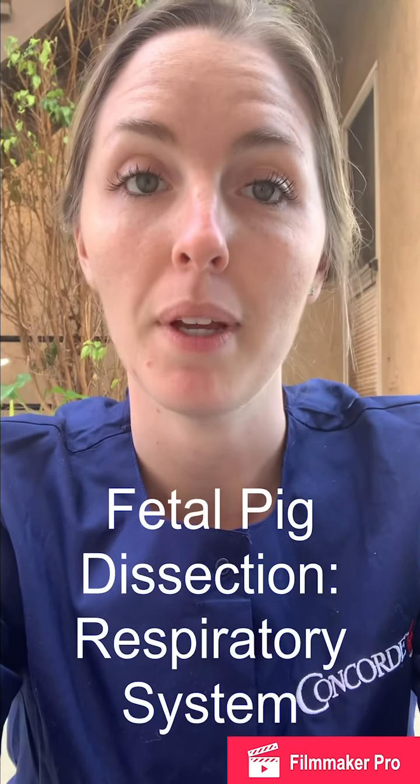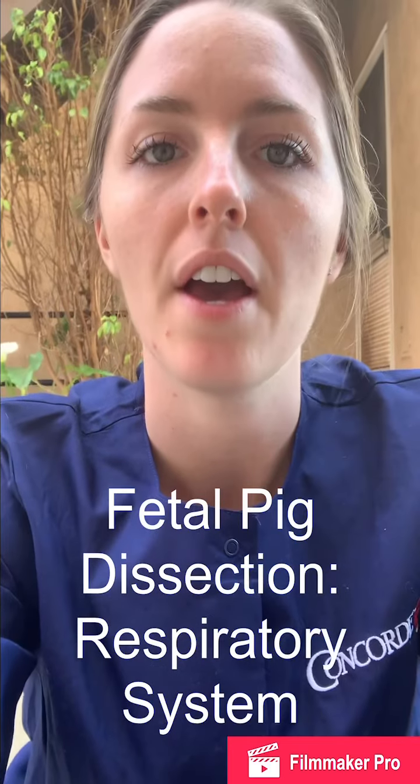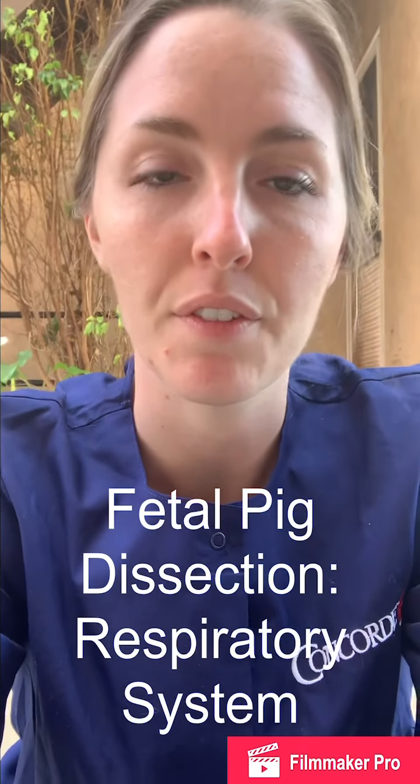I'm Heather Cope in Dr. Atala's Anatomy and Physiology class. This is week 5. I will be showing the dissection of the fetal pig on the respiratory system.